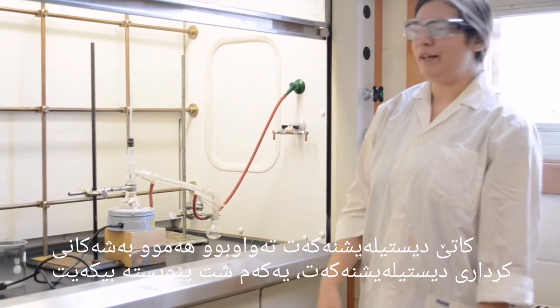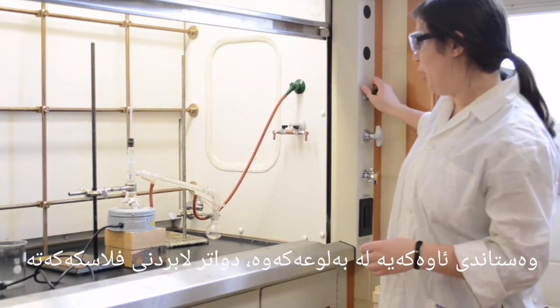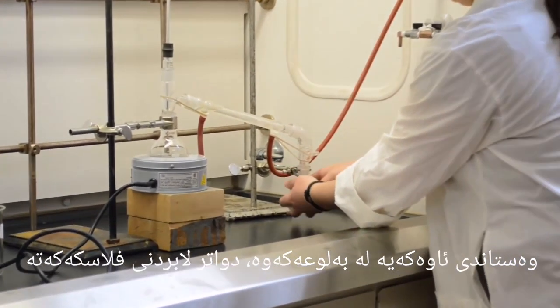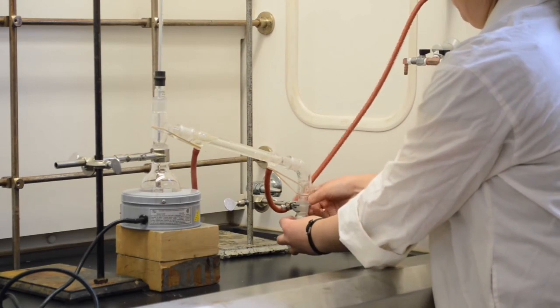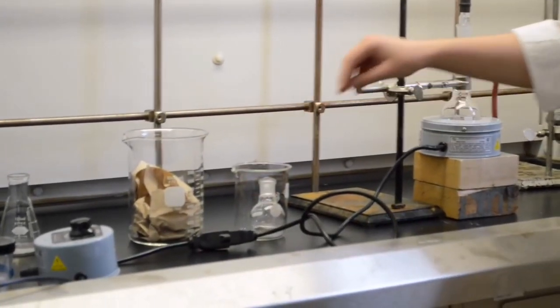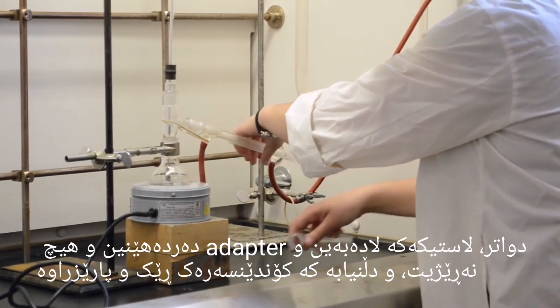When your distillation is complete and you want to take apart your distillation setup, the first thing to do is make sure that the cold water is turned off. Next, you want to remove your receiving flask and put it somewhere safe. Then the rubber band can be removed and the adapter taken off.